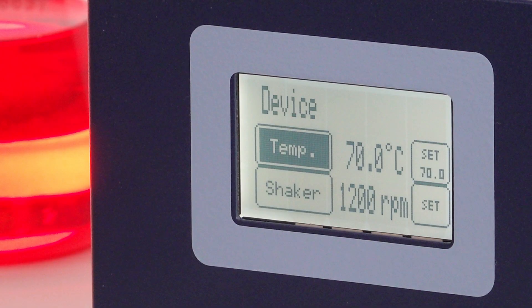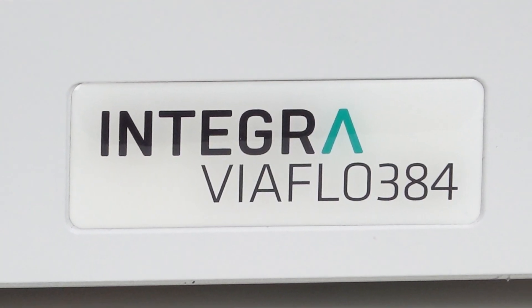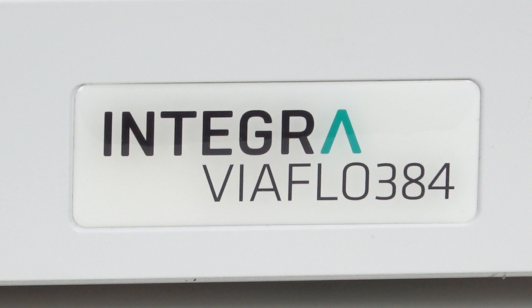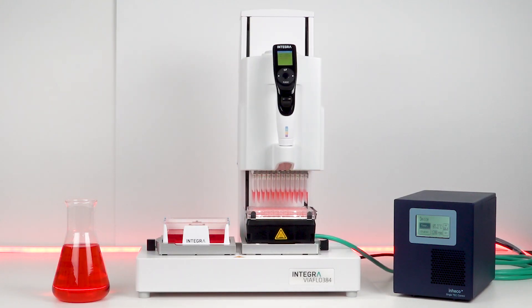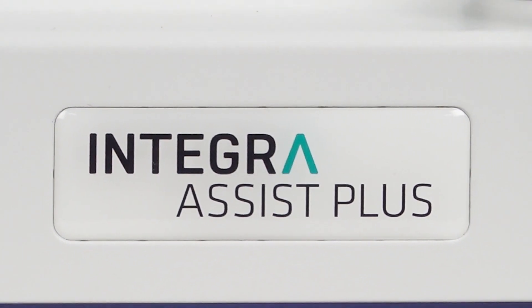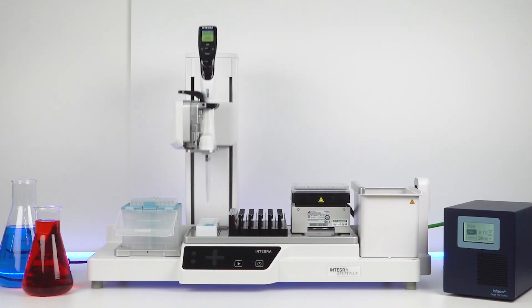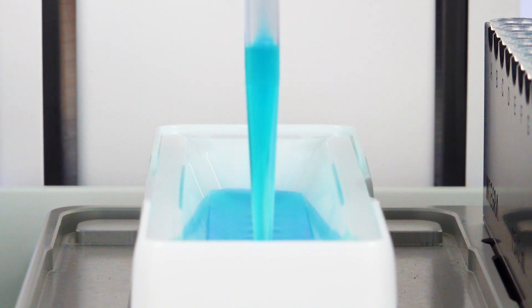These active heating and cooling blocks can be used with the ViaFlow 96 and 384 electronic pipette, as well as the Assist Plus pipetting robot. Both of these blocks can be used in either instrument.